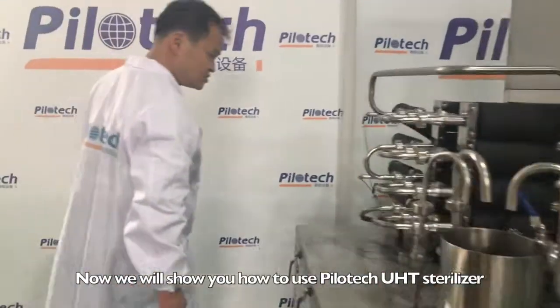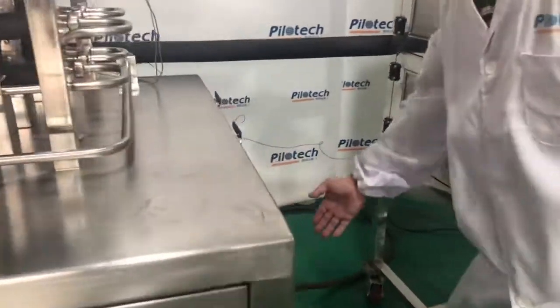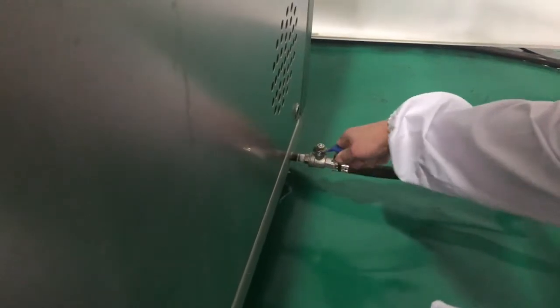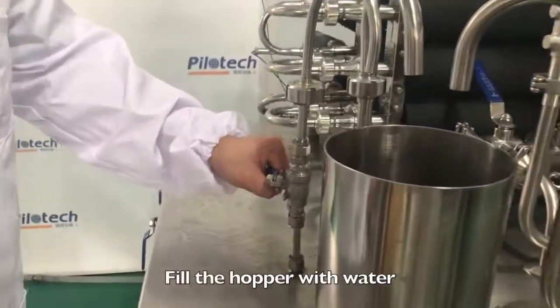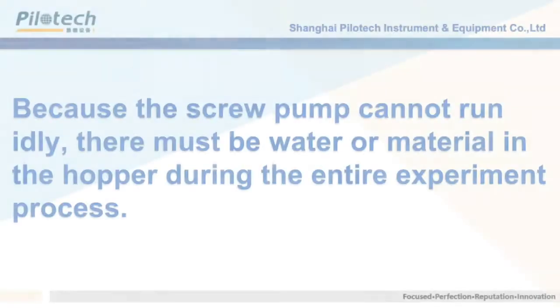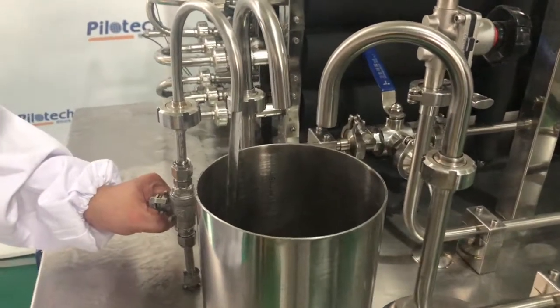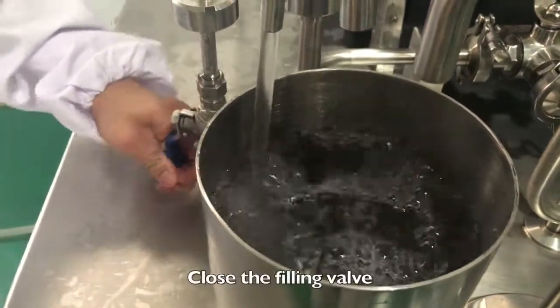Now we will show you how to use the Pilotech UHT Sterilizer. Open the water valve. Open the main water inlet valve. Fill the hopper with water. Close the feeding valve.